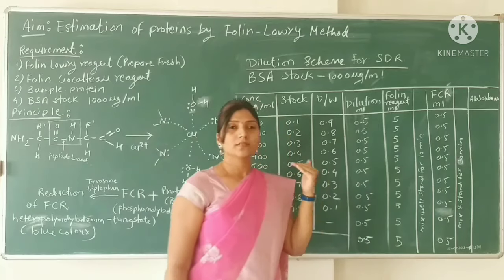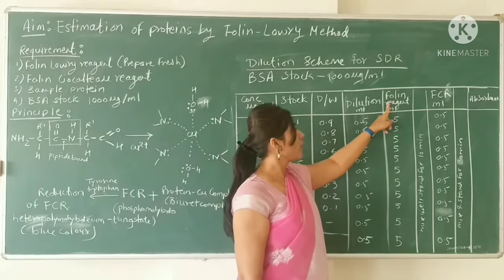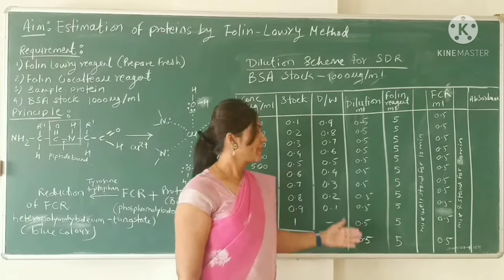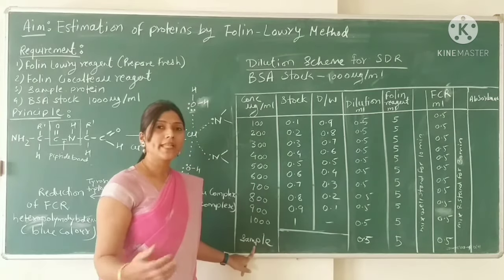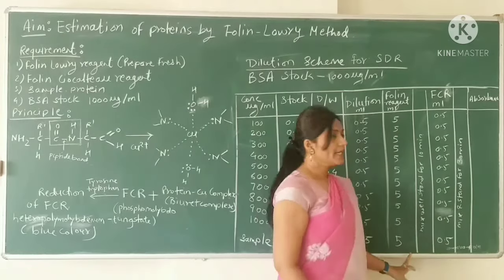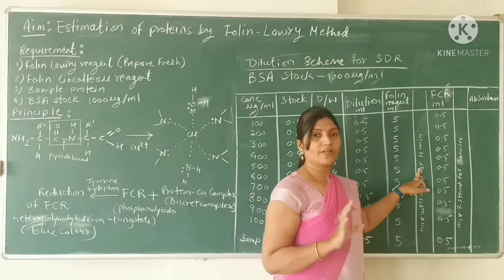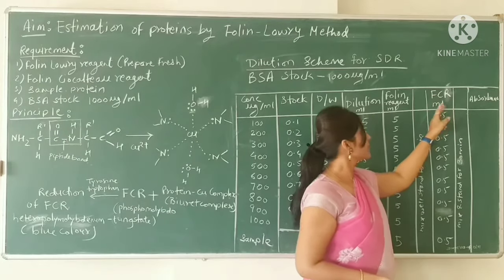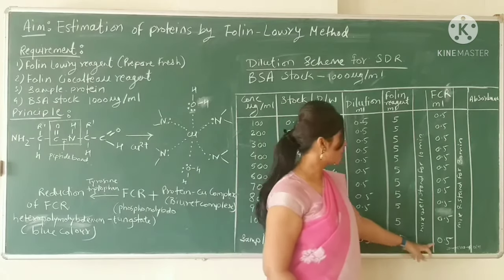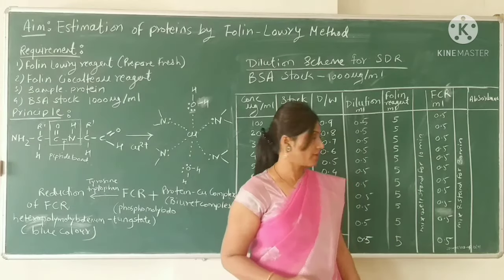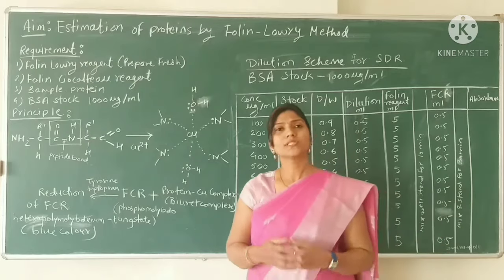After taking 0.5 ml from each dilution tube, add 5 ml of Folin-Lowry reagent to each. For the blank, take 0.5 ml distilled water, and for the sample, take 0.5 ml of the unknown sample. Mix thoroughly and wait for 10 minutes. After 10 minutes, add 0.5 ml of FCR reagent to each tube — including the blank and sample. Then mix and wait for 30 minutes. After 30 minutes, take the absorbance at 650–700 nm.